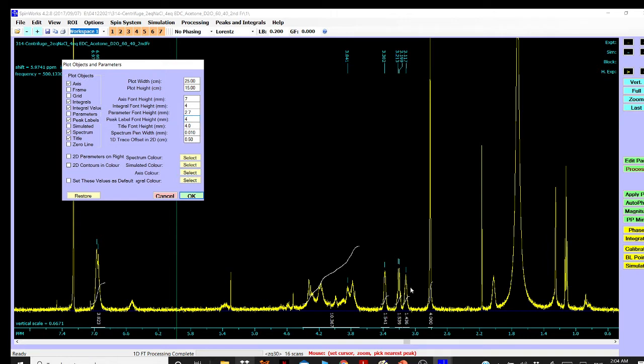If you want to see this in the software, the NMR normally shows as a yellow color, but if you go to print, it will normally give you the black color and the background will be white. Even if your software is black, in the printed version the spectrum will show black and the background will be white.